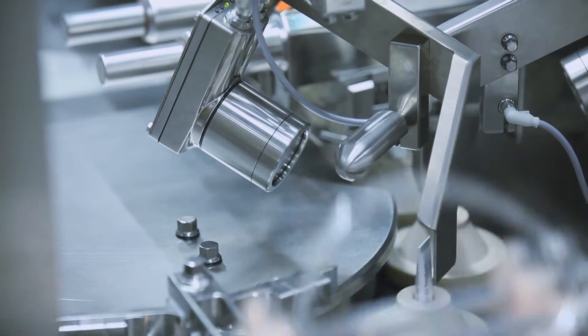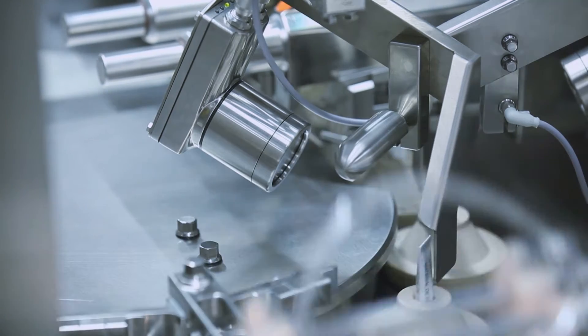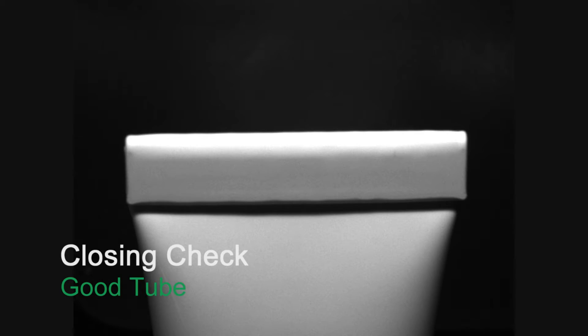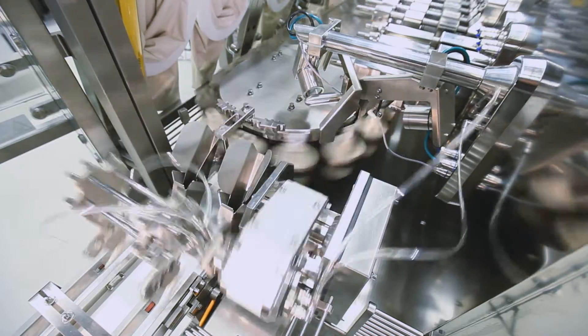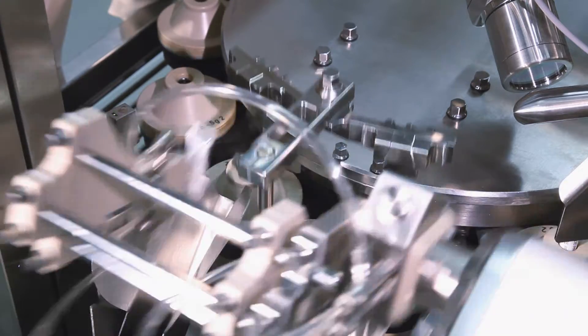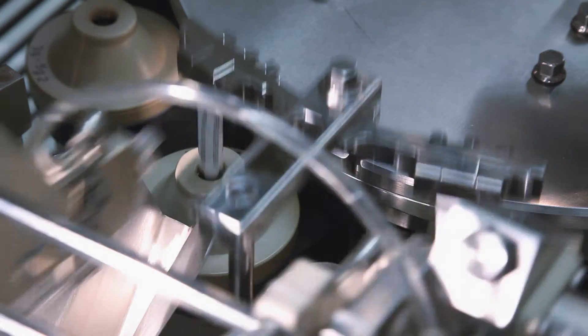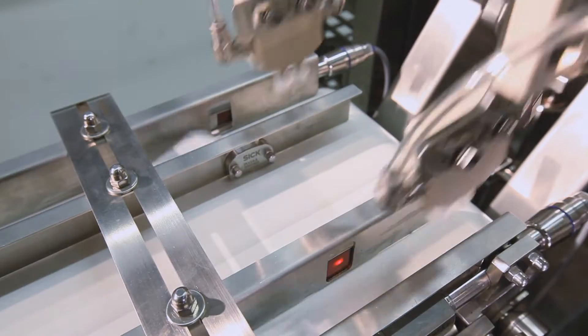After tube closing, a camera monitors the quality of the tube fold. Only good tubes are processed downstream while bad tubes are ejected before leaving the machine. In the tube discharge station, the tubes are transferred via a pick-and-place system from the tube filling machine onto a belt, which brings the tubes through a lock in the sterile room to the packaging section.